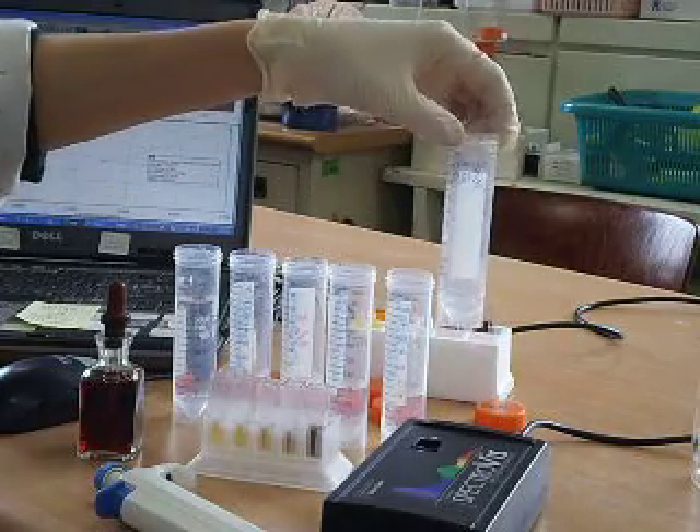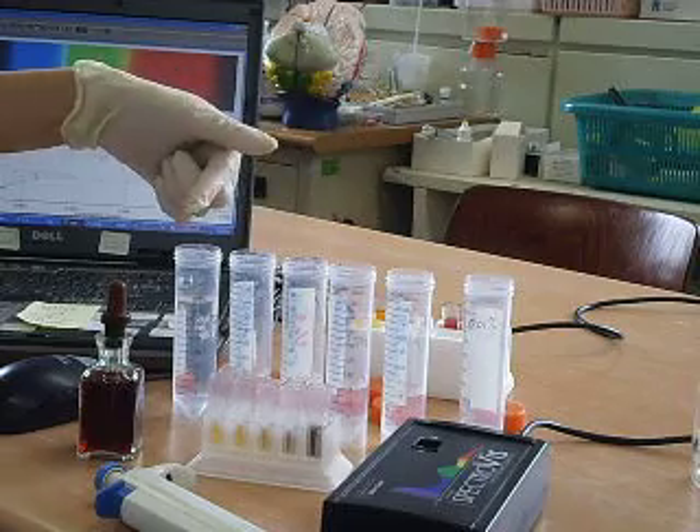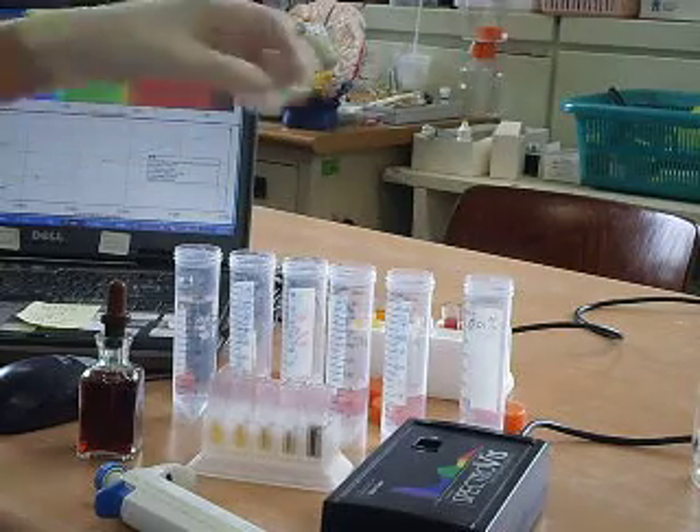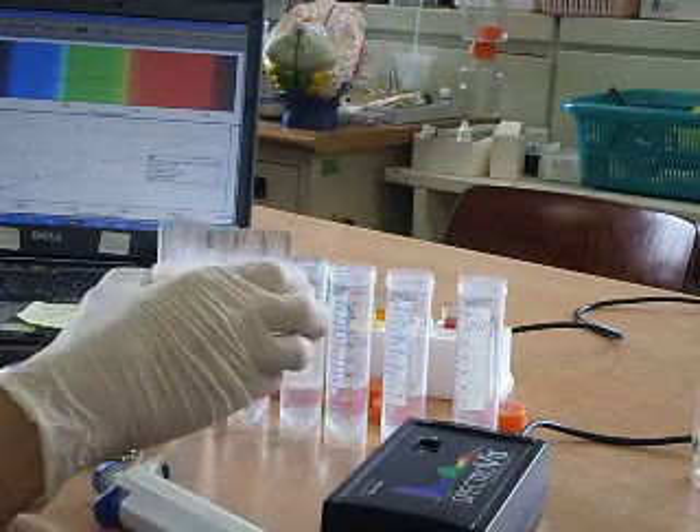I prepared a 0.01% starch solution, did a 2x serial dilution, and after that, take out 1 ml into a cuvette.